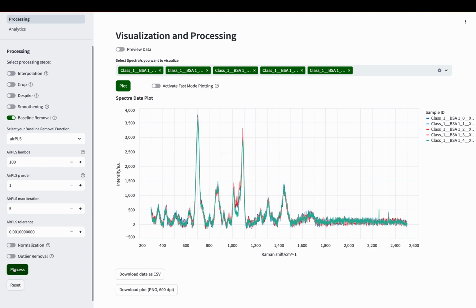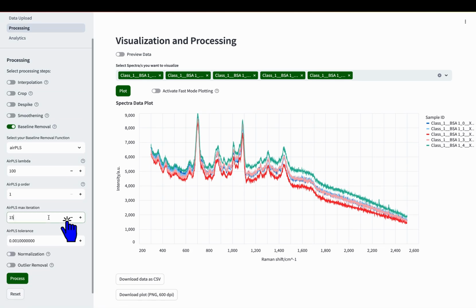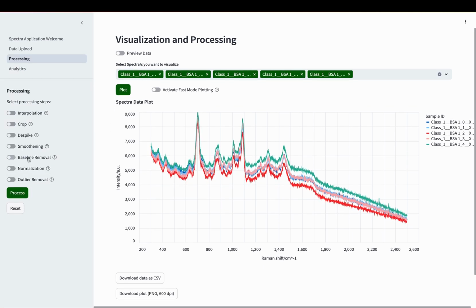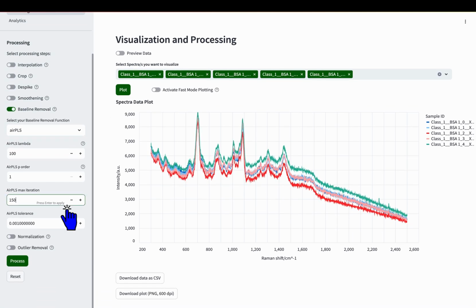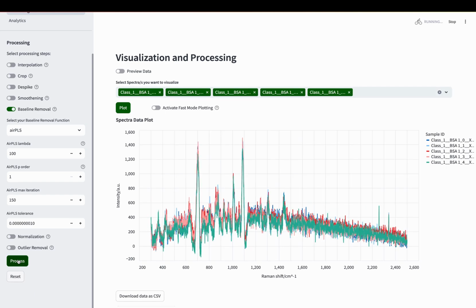We explore several parameterizations here. This approach may or may not be best depending on your needs, but multiple parameter explorations can be attempted without permanently altering your spectral data. As we've seen, each pre-processing step offers flexibility but also transparency. You always see what's being applied and you control the outcome. If need be, just reparameterize and try again.